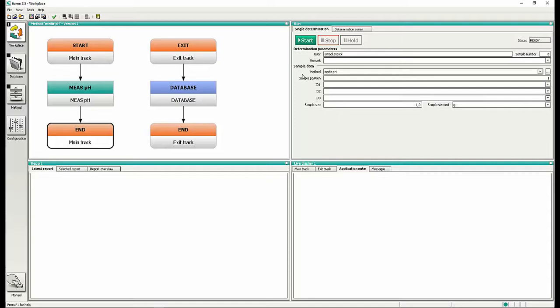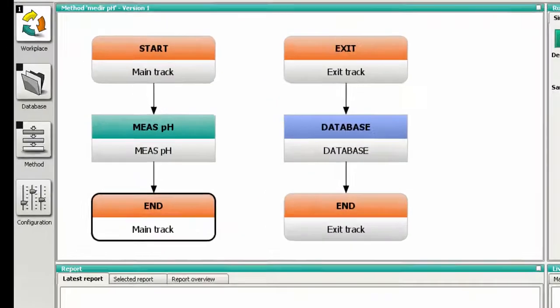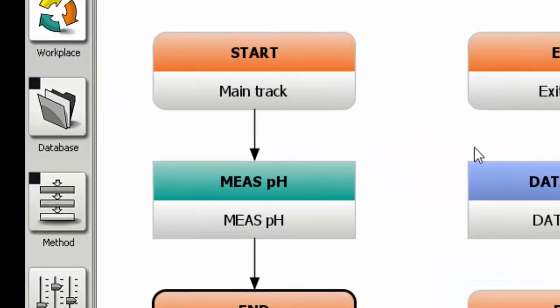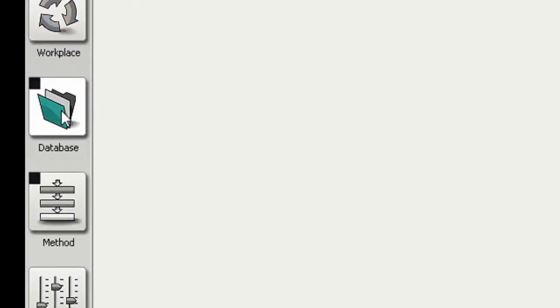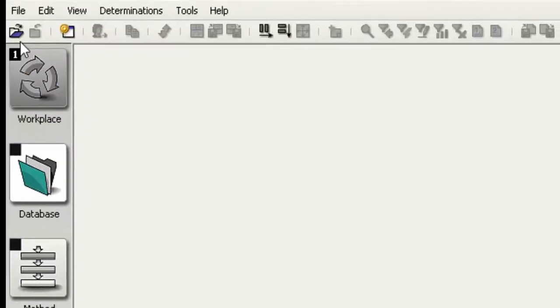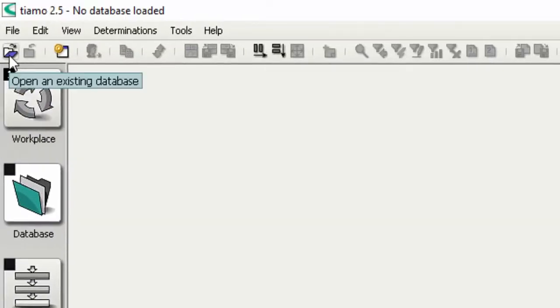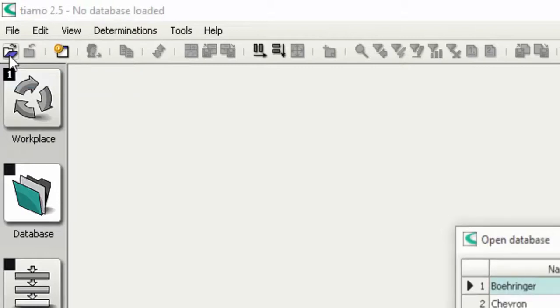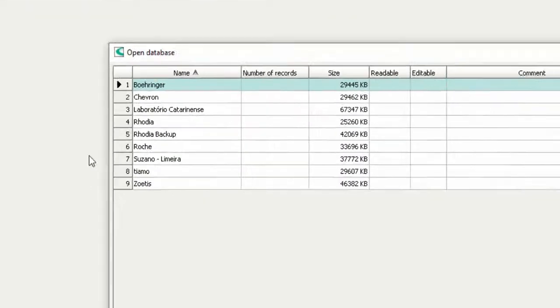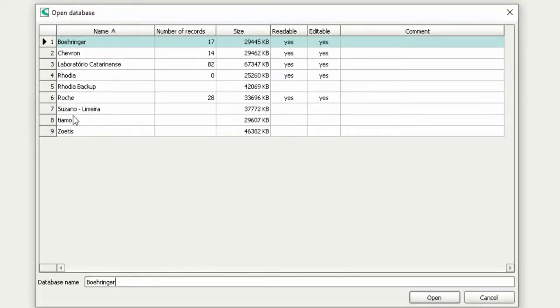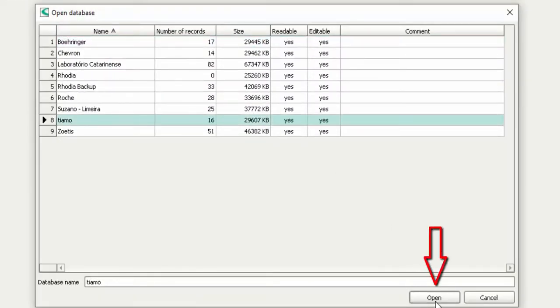First, open the database window of your software. To open a database, click the button 'Open an existing database', select it from the list and press Open.